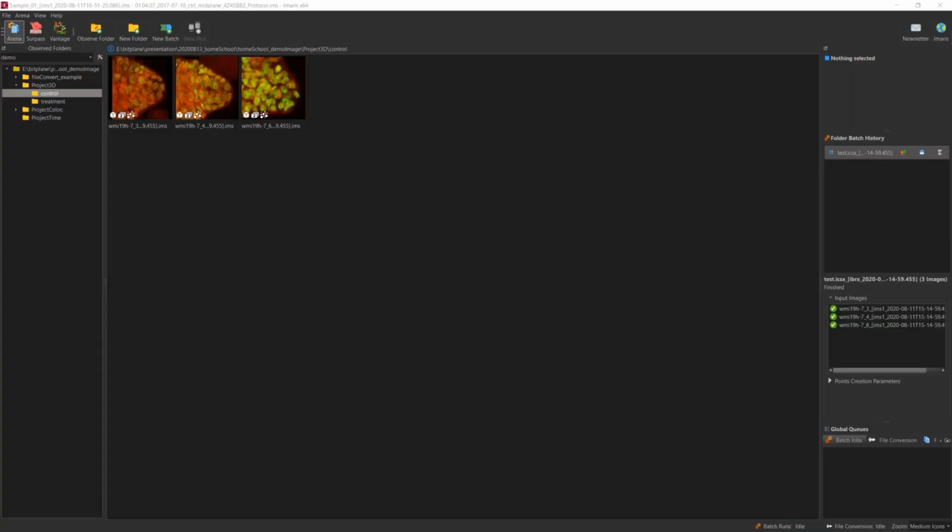Okay. So we had a few questions come in, not too many, but it would be good to ask these out for the whole audience. So, one person asked, should you determine the parameters for spot detection, and this would be true for other types of detection too, should you determine those parameters for control and experimental images separately, or should you have one spot detection parameter for all conditions?